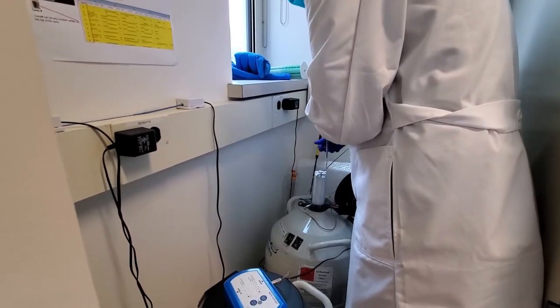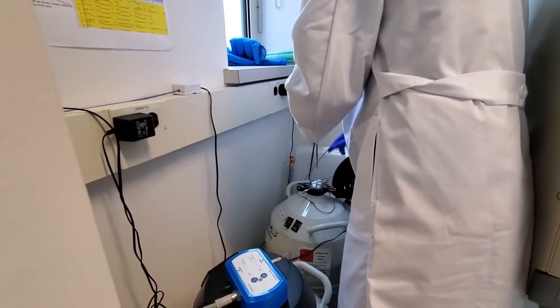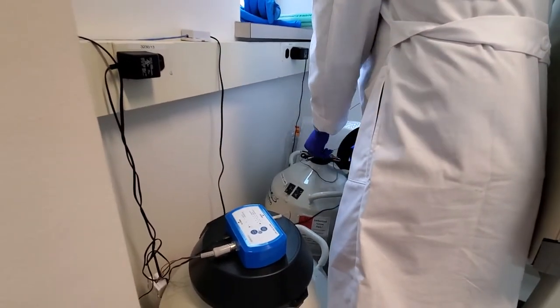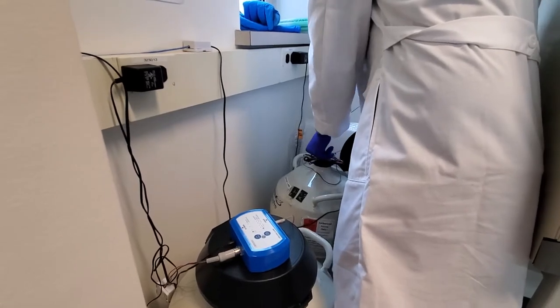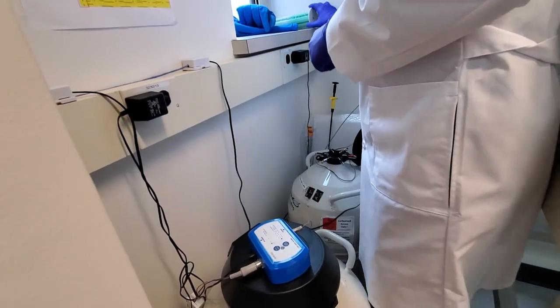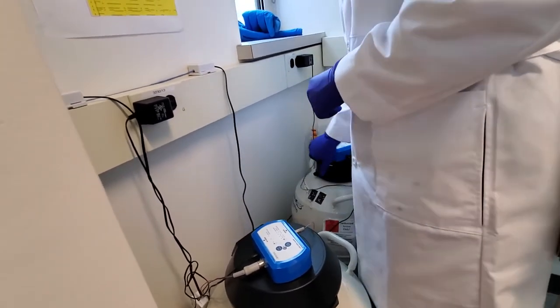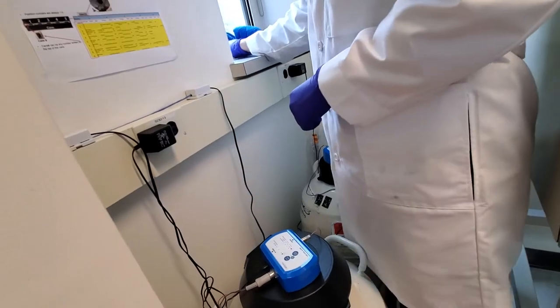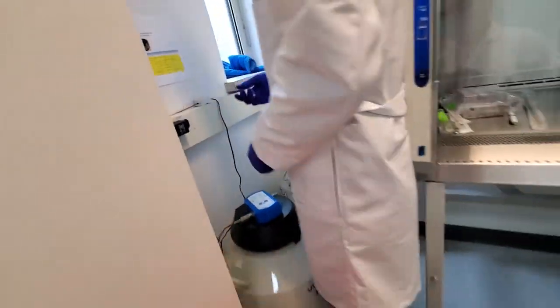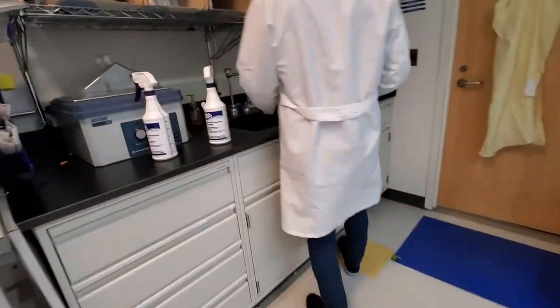Okay, so the color codes on the spreadsheet refer to the tape? Yep. They refer to this part up here, and then the containers, and then within each container there's up to, like, the long metal things, which are the canes. And then take it out. We should remember to update the spreadsheet so that we know that we removed one of these. Later. Look for it later.